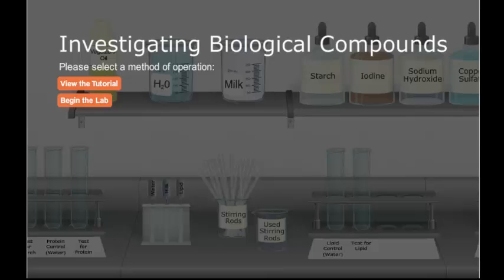Starches are also called a large type of sugar or complex sugar. And so we'll talk more about these compounds in lecture on Wednesday, but for right now, we're just going to work on testing for them.